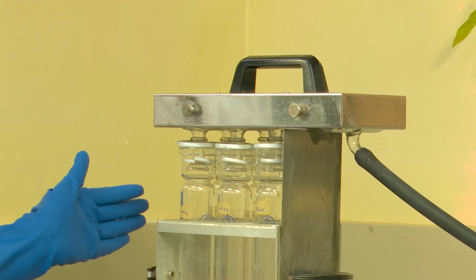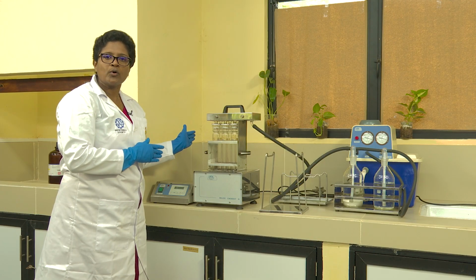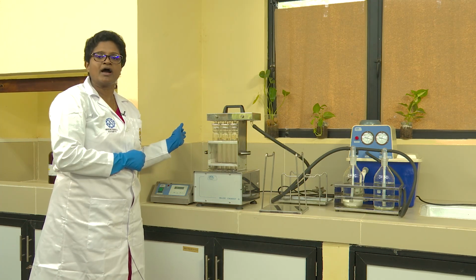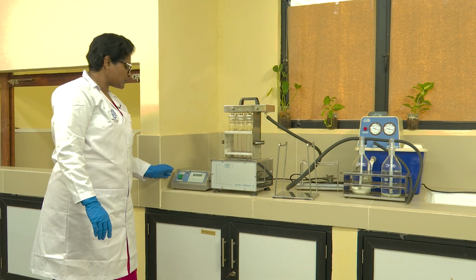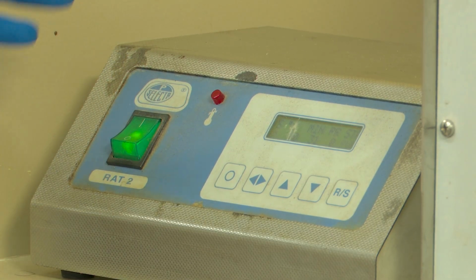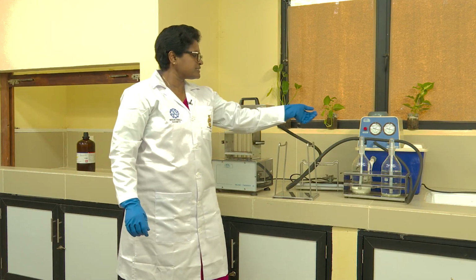And now you can start the digestion process. Initially, at a slow rate, you have to increase the temperature gradually up to 400 Celsius. Then you have to switch on the digestion unit and then the scrubber unit.